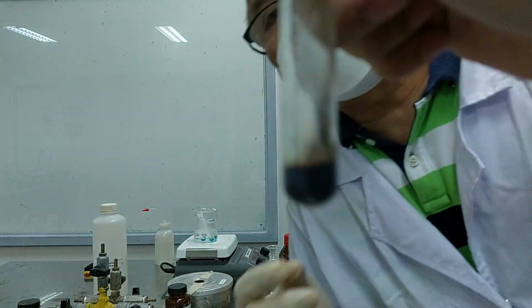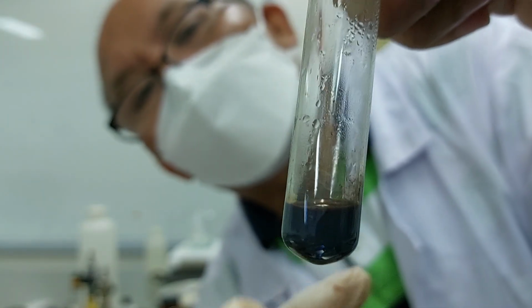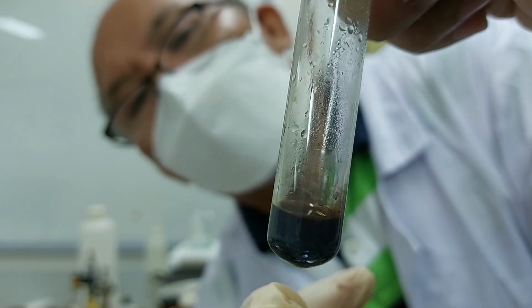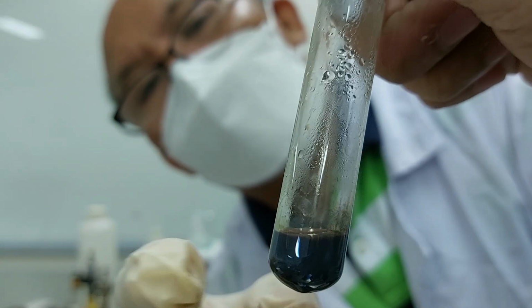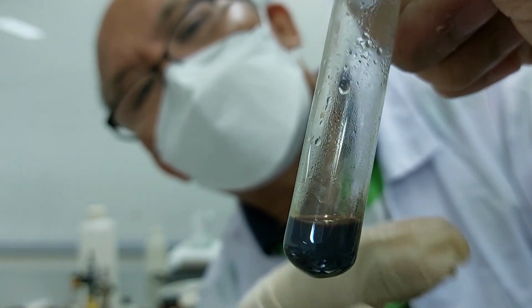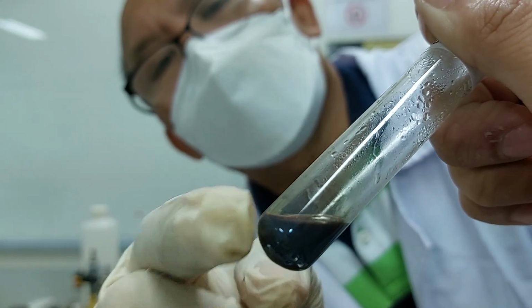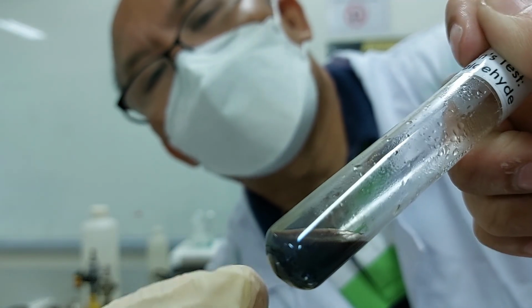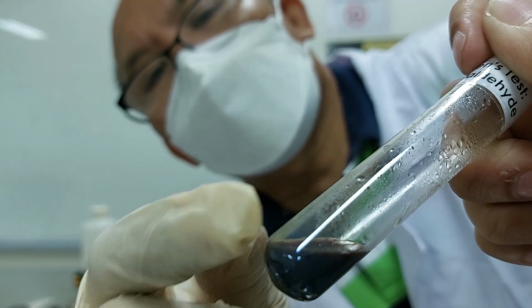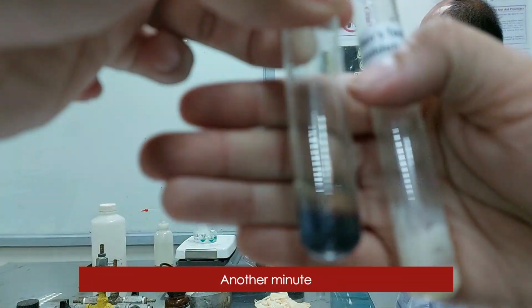If you notice, class, because of the color of the solution, you will notice the silver sticking on the side. That portion is not easy to see because of the black solution, but that shiny coating on the test tube is the silver.